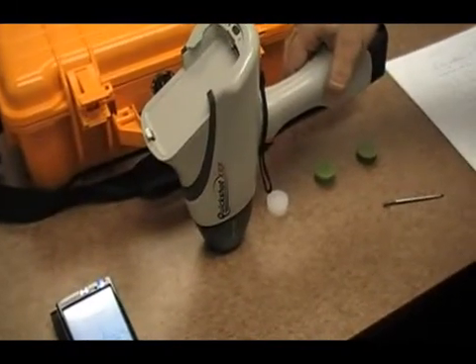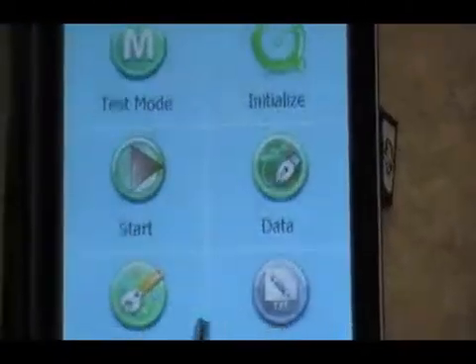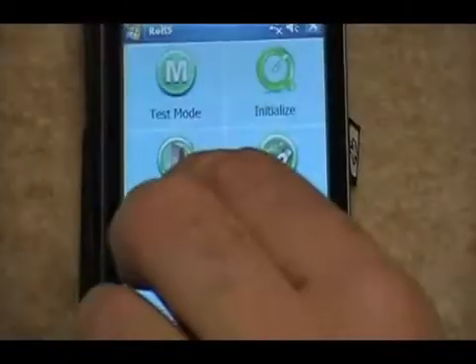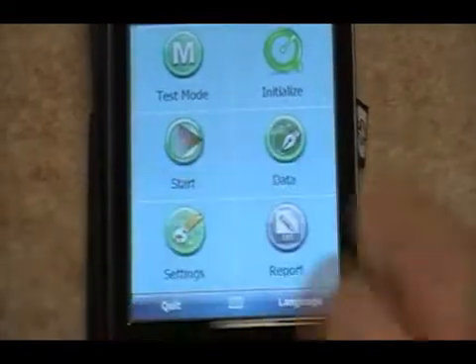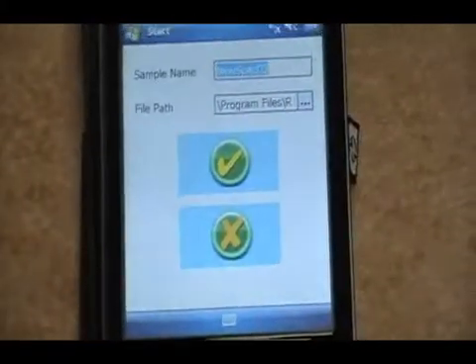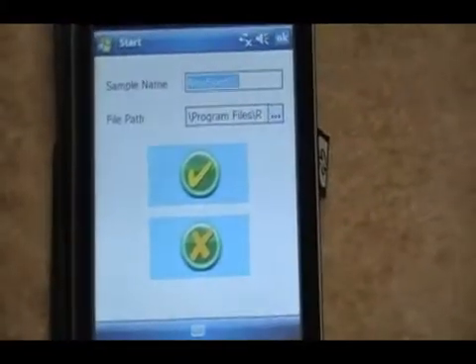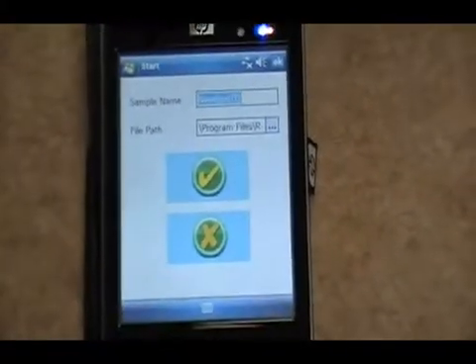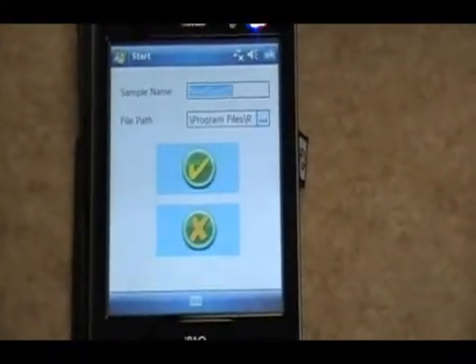And there, your initialization is complete. So now we go back to the main page, which is the bottom corner, hit start, and it will come to the screen. We can name this something.